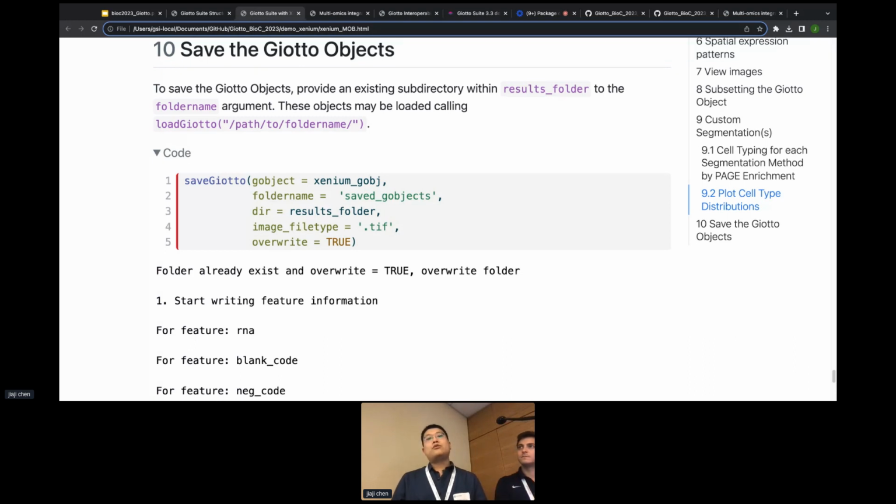We also do have some convenience functions that allow you to load in specific types of information, through predefined workflows that we have, mainly revolving around the fact that we know specifically this is the output that we usually see from these packages or these platforms. These are the folder structures, and then after that, we can find specific types of features, whether we want to filter those out for any particular reason, this kind of stuff.